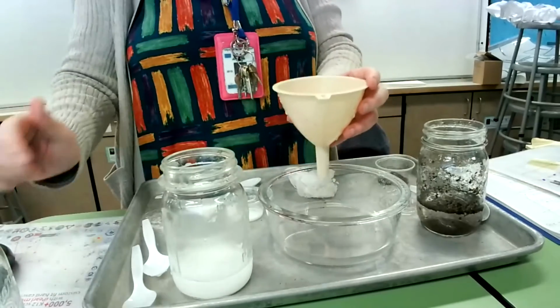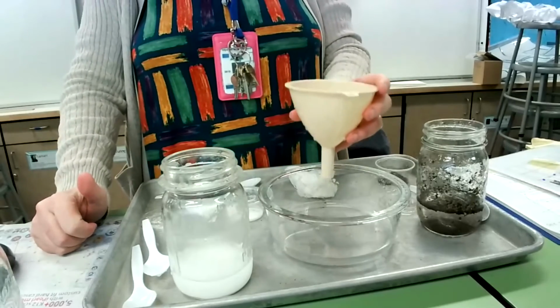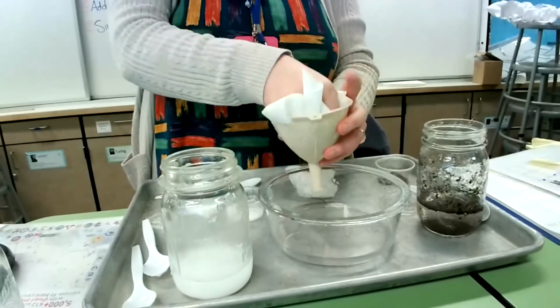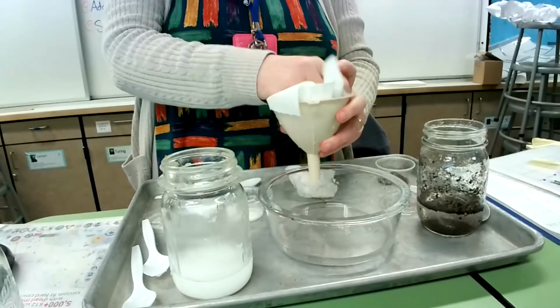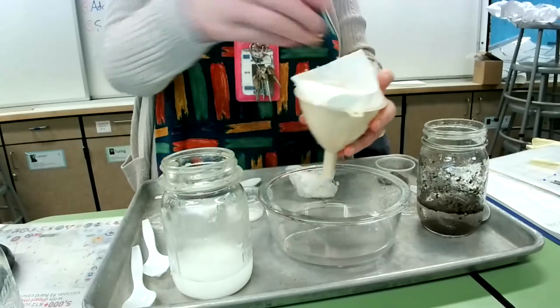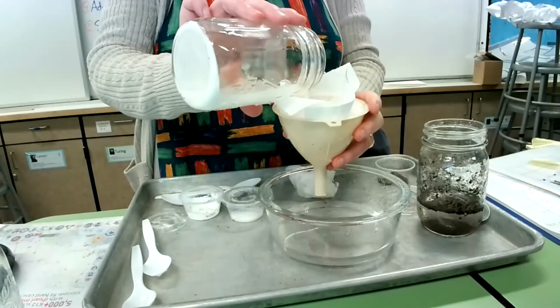And so sugar water, we made a solution because the substance we put in there completely dissolved. So that would be considered a solution. If it's a mixture, not everything dissolves. Okay, so now I'm going to do the cornstarch in water.